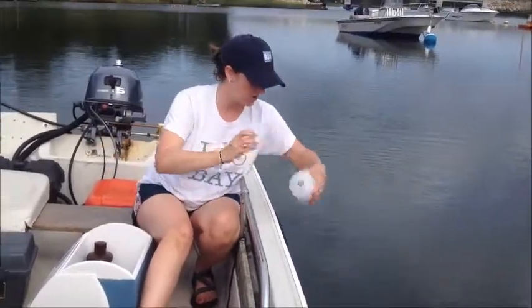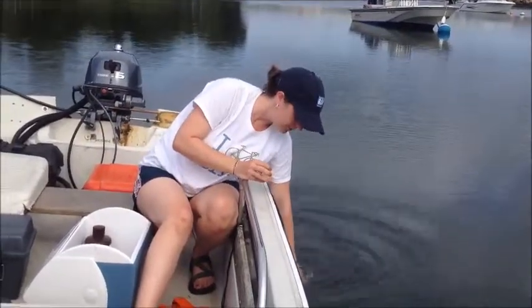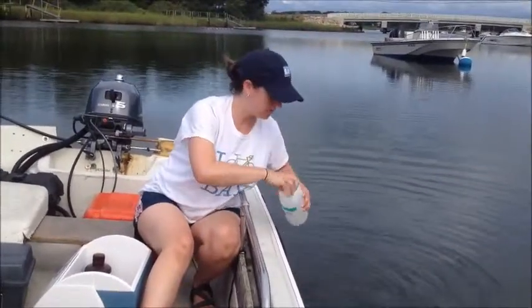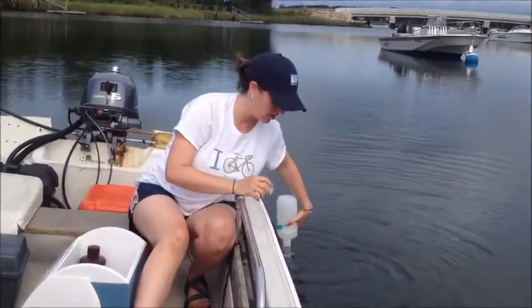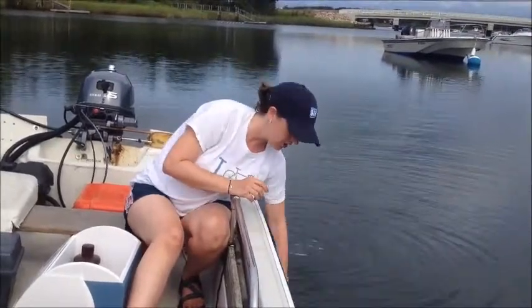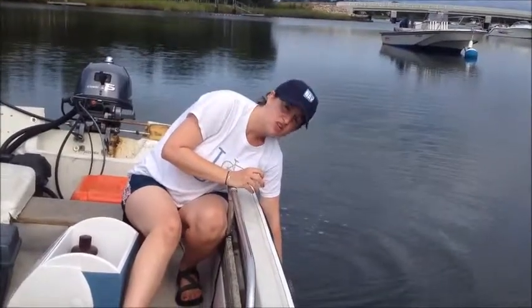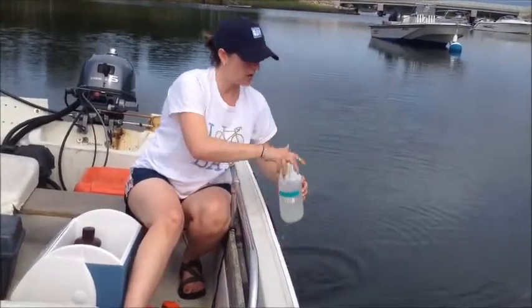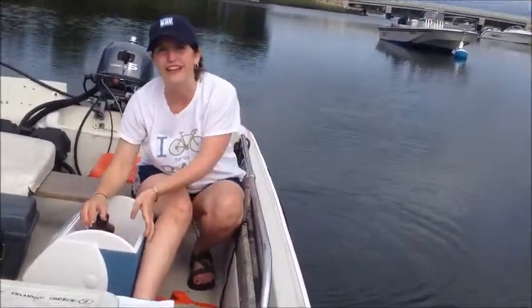Both bottles go into our handy dandy cooler here to keep the samples at temperature while we're getting them around to the MBL so that they can process them. And they're measuring a variety of different nitrogen concentrations in this white bottle, also inorganic phosphate. And in the dark bottle, we're looking at algal pigments.